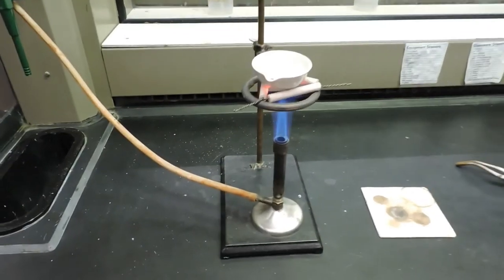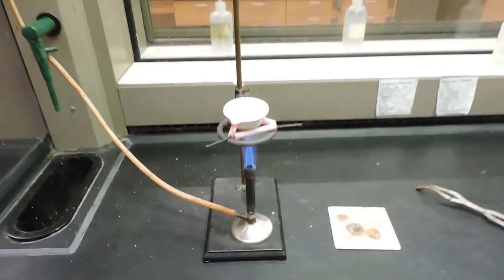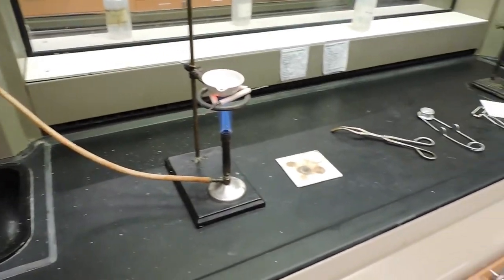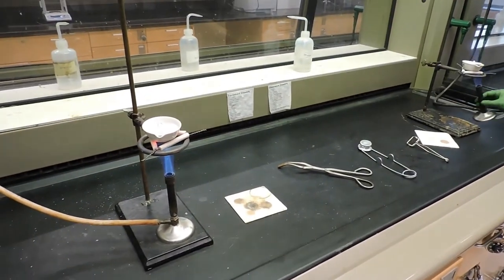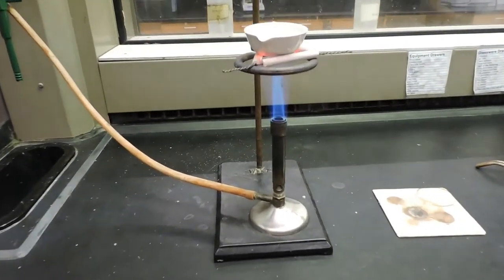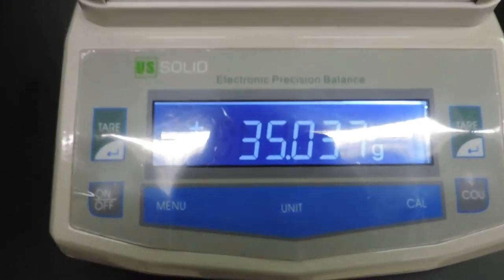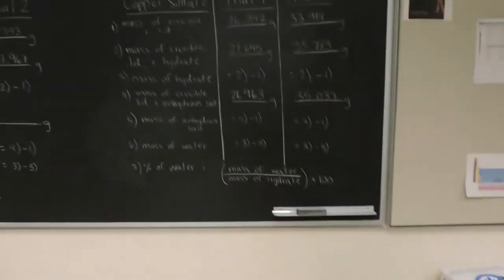The second trial will proceed just as the first. Initially, we will gently heat these and then heat intensely for 10 minutes before allowing them to cool to room temperature and then finding its mass again to determine how much water was removed. The mass of the crucible containing the copper sulfate, trial 2, is 35.037 grams. Recorded here.